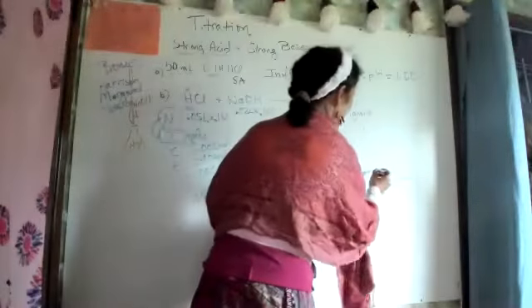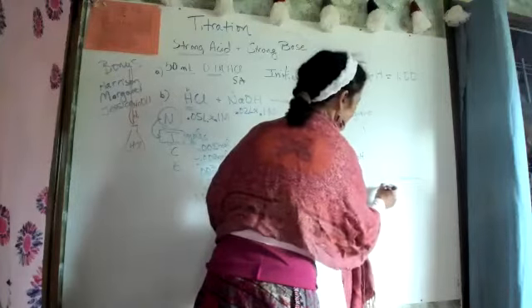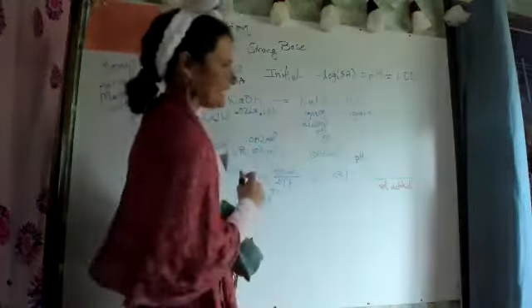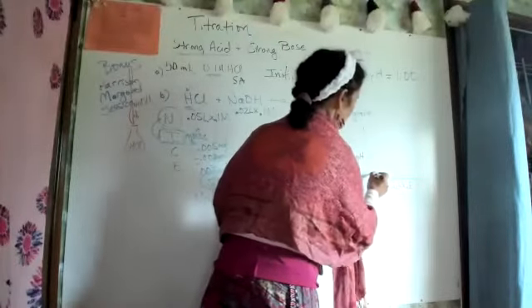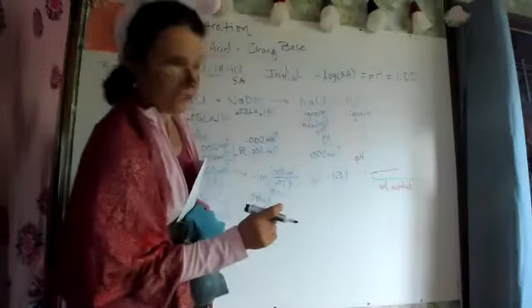We're going to do brown because you have to be able to see it. This is pH, and this is the volume added. So pH is my y-axis, and the volume we're adding is the x-axis. And we're starting really low, pH of 1, and our pH is barely changing.